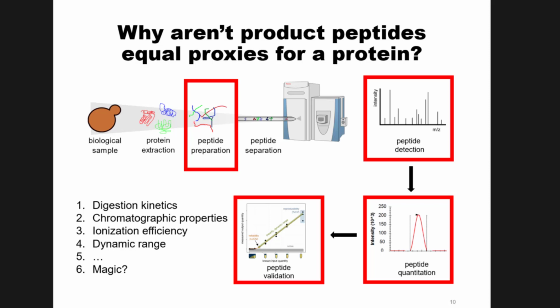The denaturation affects how much the protein unfolds. The digestion conditions we just saw can vary widely between different samples. We're separating peptides and almost inevitably losing a bunch of peptide to the column. We're trying to get them to fly. These are fairly large molecules that we're ionizing, right? And then we're trying to measure them by mass spectrometry. We have to detect the MS2, and not only one MS2, but multiple MS2 to get points across the peak in the chromatogram. So we're actually manipulating the samples a lot.